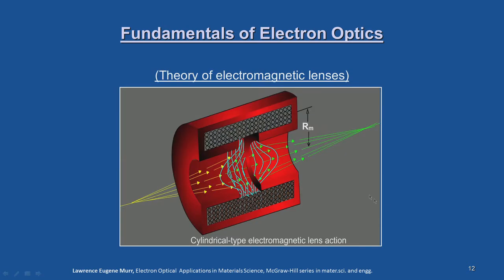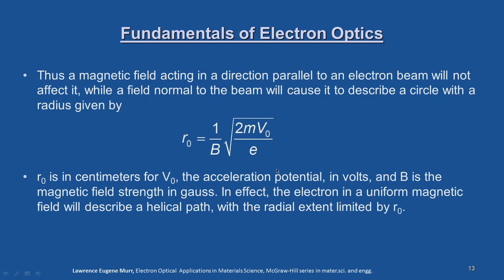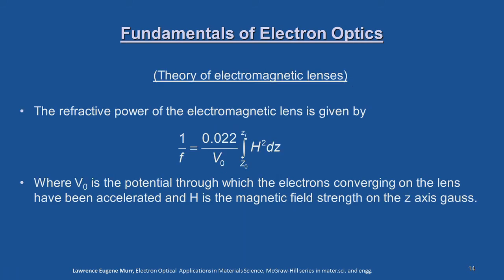So, what you have to remember is this is r, where you have the circular beam or field represented around this region. So, now we will see how the other parameters are getting affected.